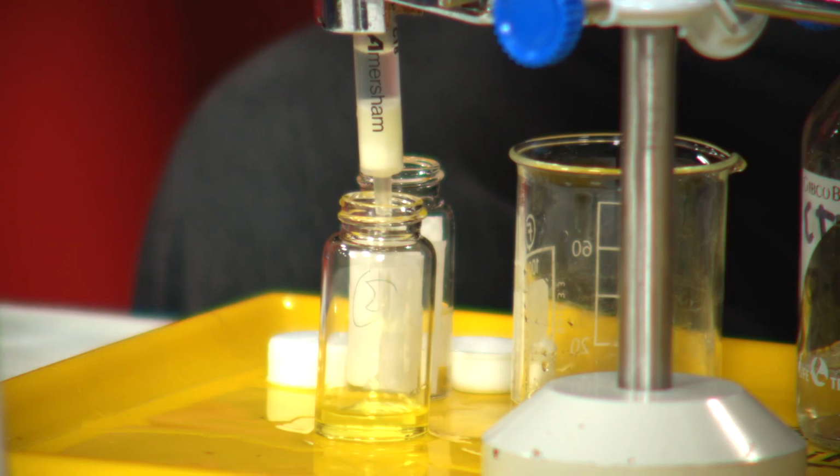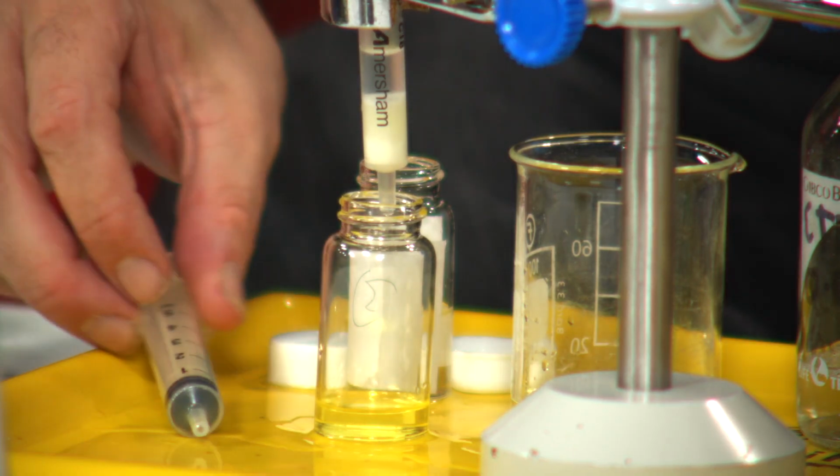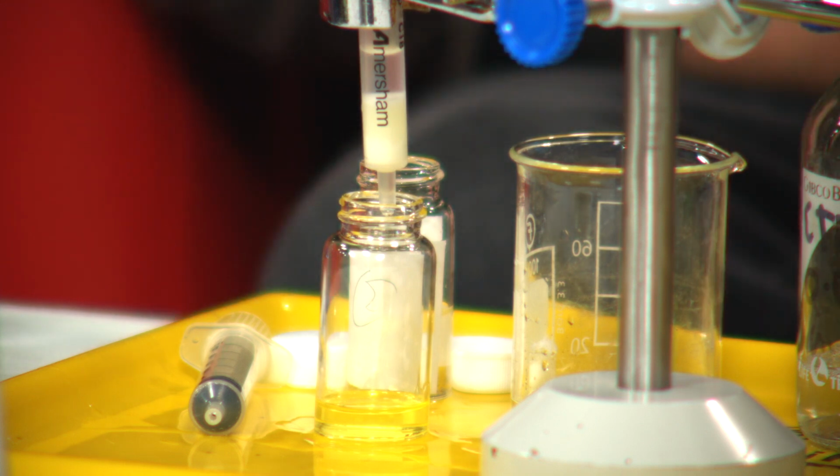And the thing with that is if you take a sample from a human, so if you take a sample of urine or blood or any of those things, as you can imagine, they have got lots and lots of things in them. So if you want to try and pick out what those biomarkers are, which actually indicate what the disease is, you really do need to separate them. So chromatography is absolutely a key technique to use to do that, and it goes across all sorts of different areas. Now, Nick's just very nicely demonstrated that, because you can see the yellow come out very clearly.